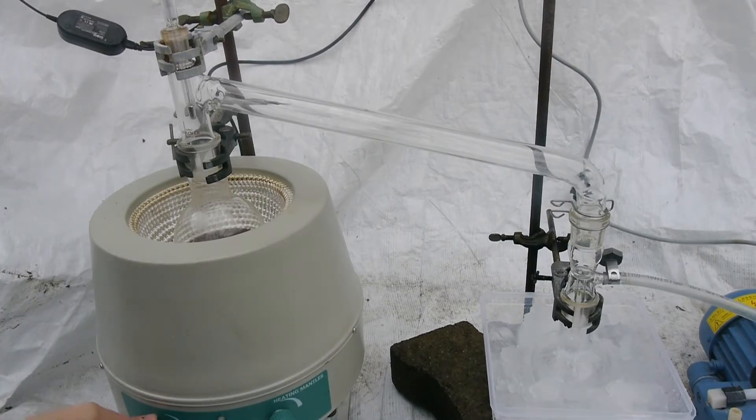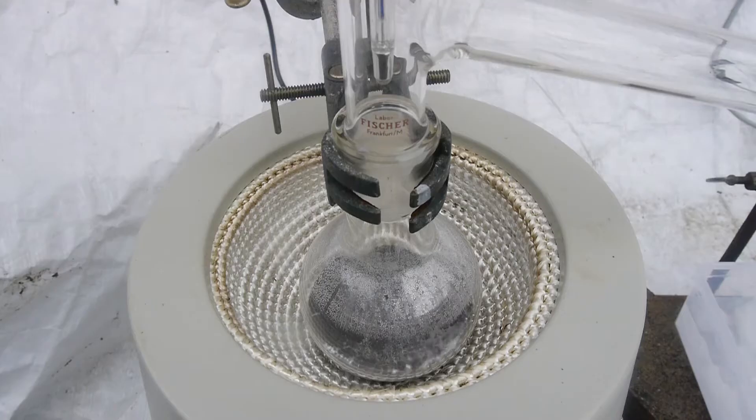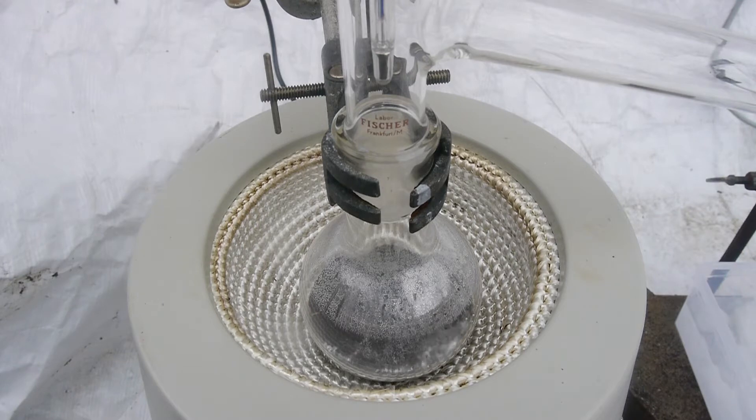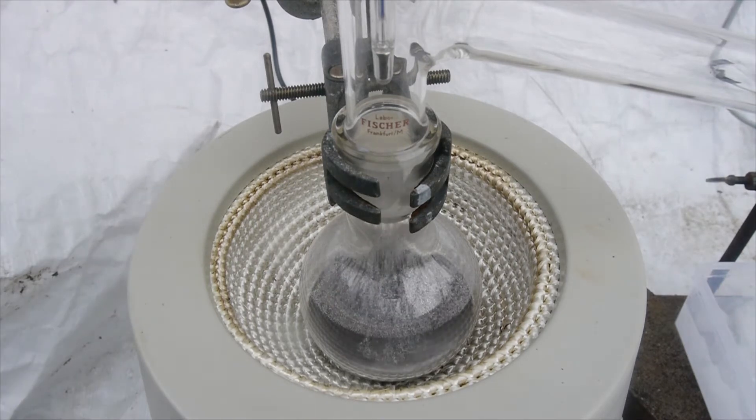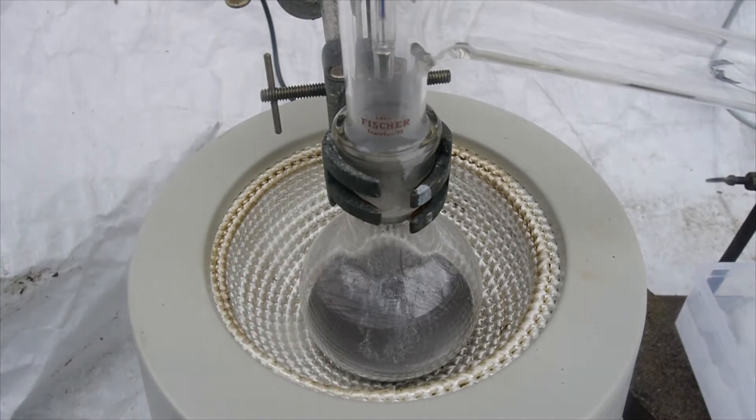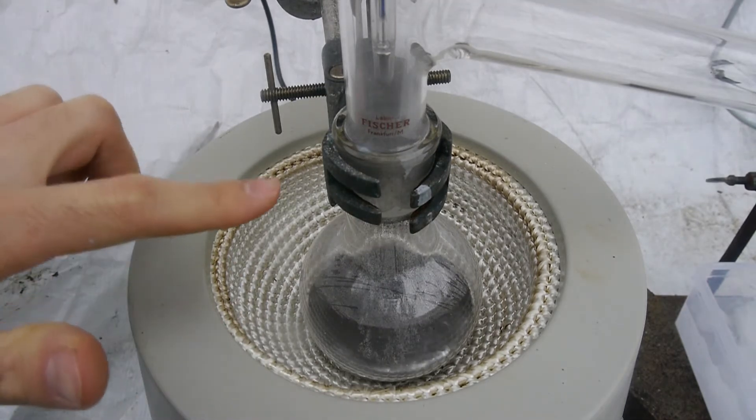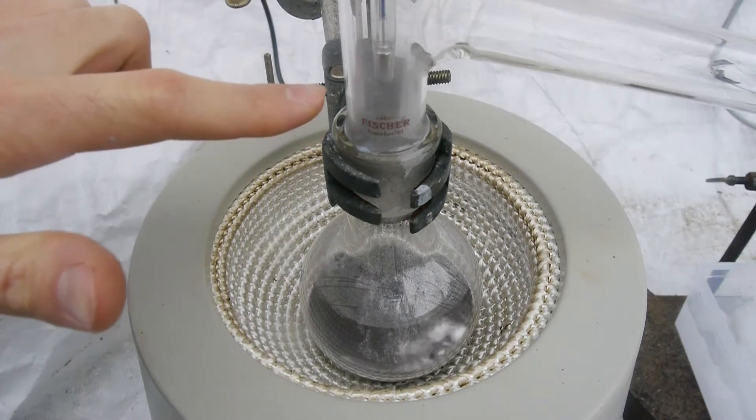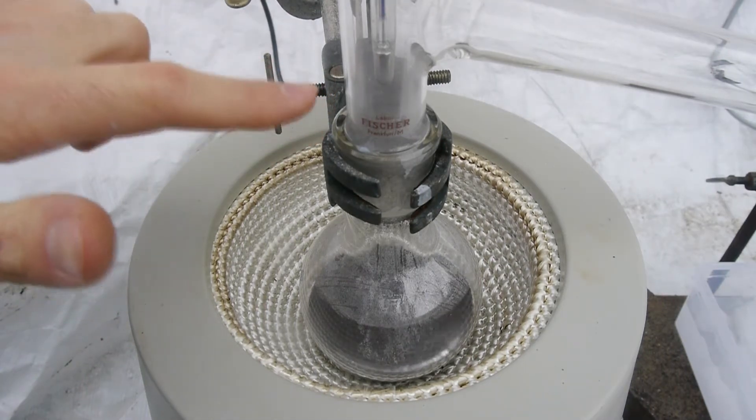Now let's turn the heat to full blast and hope this will distill over without any incidents. Looks like we are slowly approaching the boiling point of mercury now. Now we can very slowly see the invisible vapor front of mercury rising by the drop that's condensing up here in the glass.